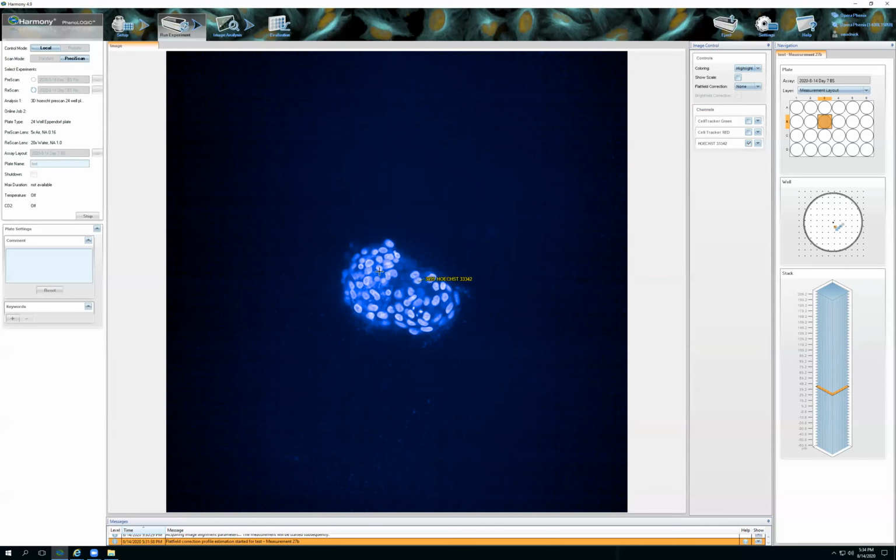My nuclei are... pause because it finished imaging all of these. So now it's saving everything. Okay, there we go. So now you can see that these are nice. These are good. I want them to be at least 2,000-3,000. So now I'm going to just go through and look a little bit higher. These are still above 2,000.